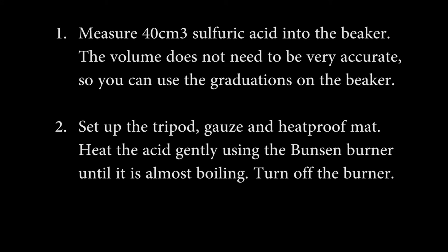Step one, measure 40cm cubed of sulphuric acid into the beaker. When you're doing this you're not going to need a measuring cylinder because we don't need to be that accurate. We're going to be adding the copper oxide in excess anyway so it's okay to use the graduations on the side of the beaker.